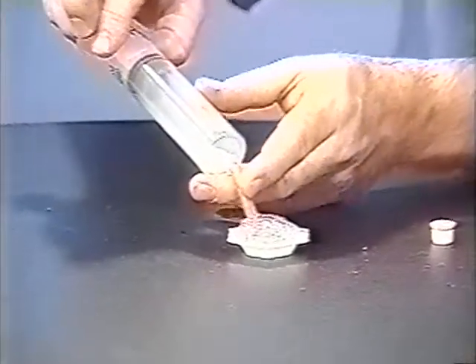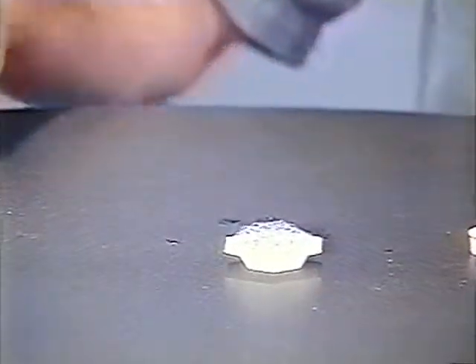Make as big a mound as you want, then I'll cap the syringe. We'll go ahead and ignite it — this will be sort of loud.